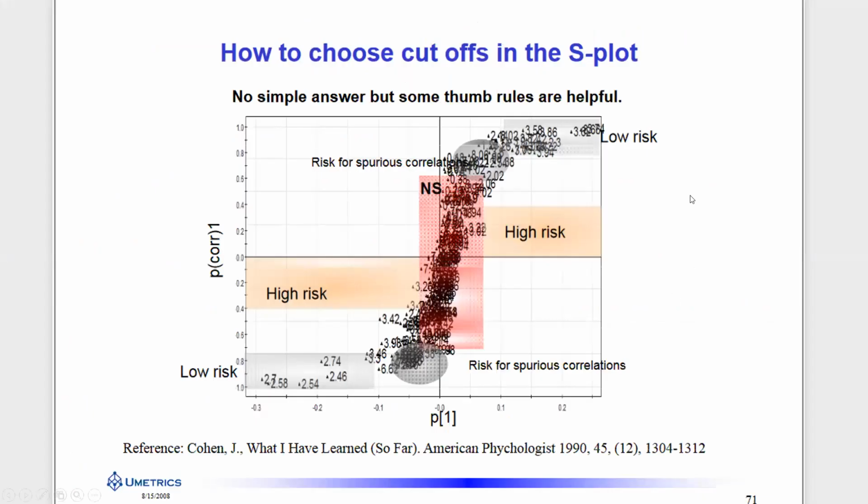Here I'm just demonstrating the S plot, which I think a lot of us usually struggle with, to know when do you stop when you're selecting your biomarkers or your chemical markers that are responsible for variation in a data set. So this is adopted from Cohen, the metrics reference that I used, where the shape of the variables assume an S if you're working with two groups.